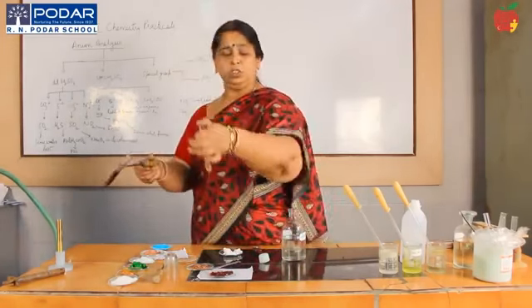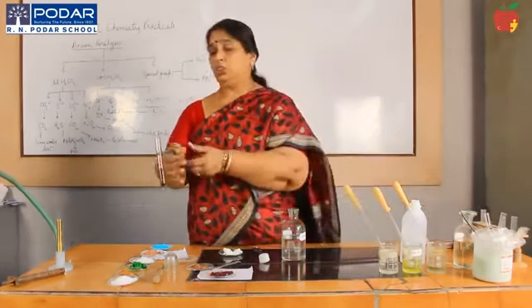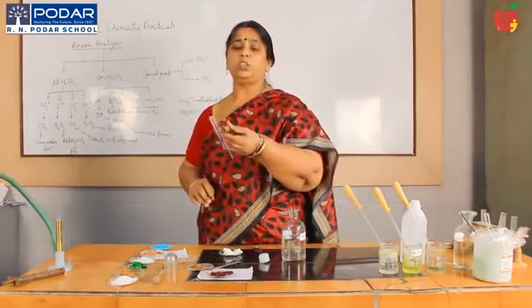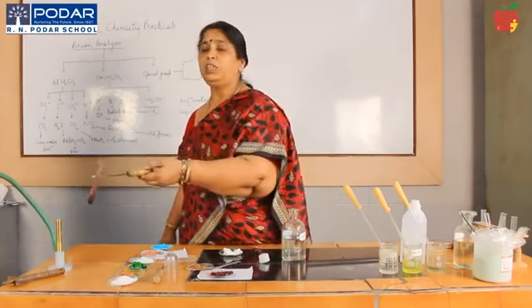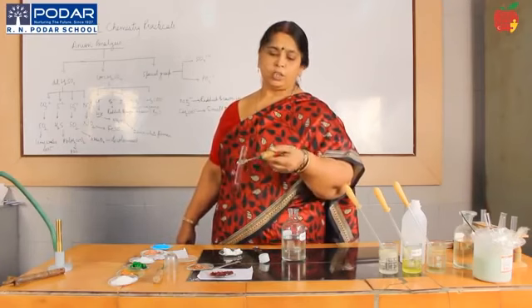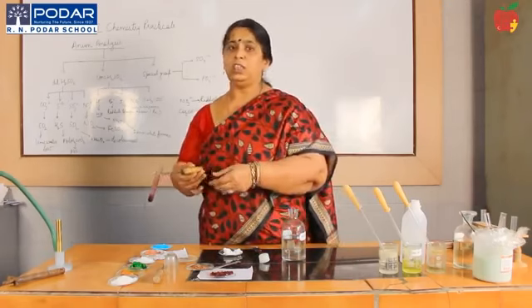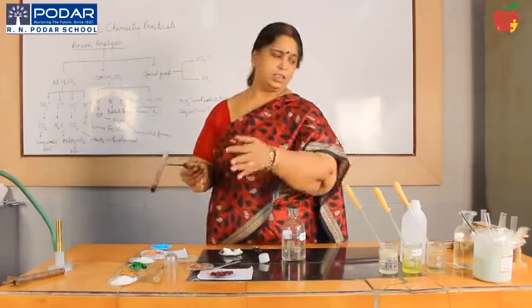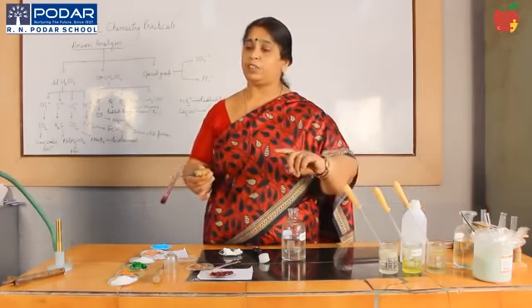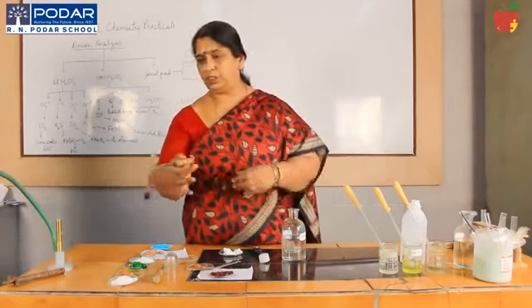So when you added a drop of concentrated sulfuric acid to the salt solution, you saw some fumes. We heated it and saw some reddish brown gas, and to confirm whether it is a bromide or a nitrate, I added copper turnings, and the brown fumes intensified. I passed this gas over the ferrous sulfate solution, which turned black. That is not necessary, I just did it for your confirmation.